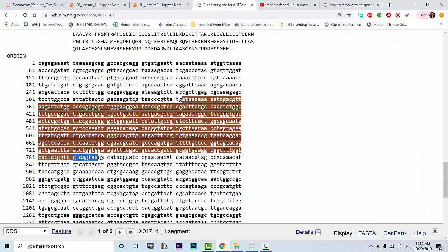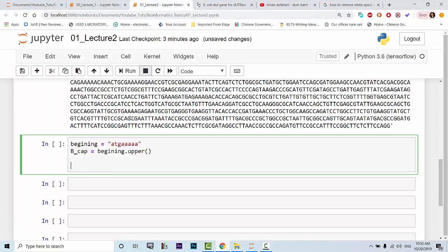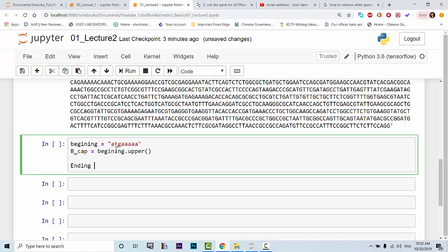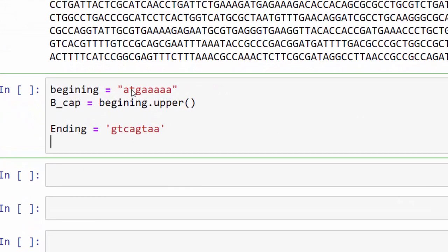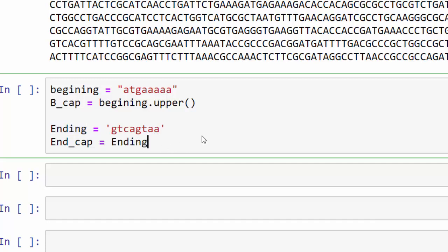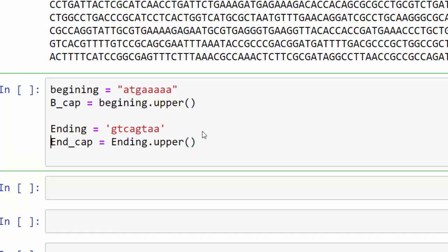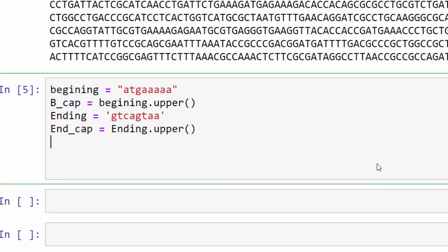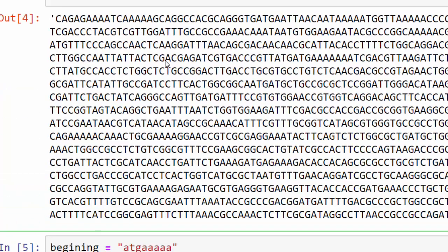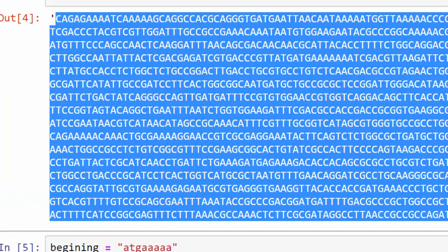We do the same for the ending. We do the same for the ending. So we take this part, we say ending equals this one, and end capitalized equals the same thing, so dot upper. Now once we run this we actually get all of those capitalized. Now those two are capitalized.